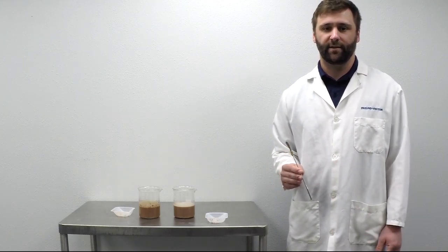So instantizing can help improve the product dispersion rate without actually changing your formulation for a better overall quality product. If you've got questions about the instantizing process, we'd love to work with you on it at Freund Vector. Thank you.